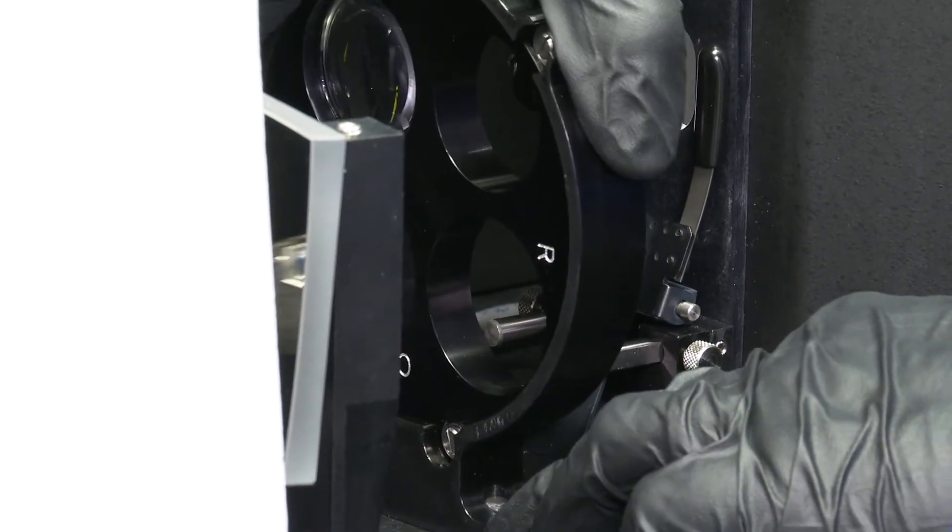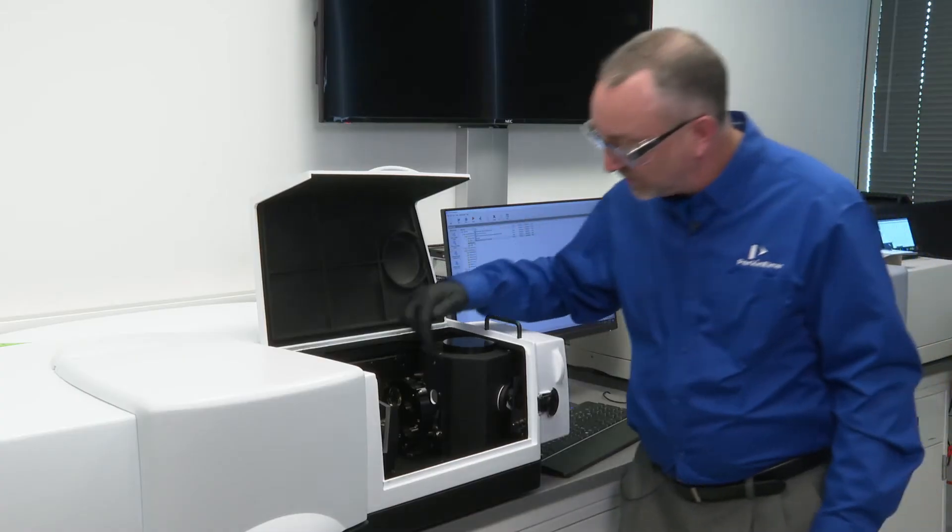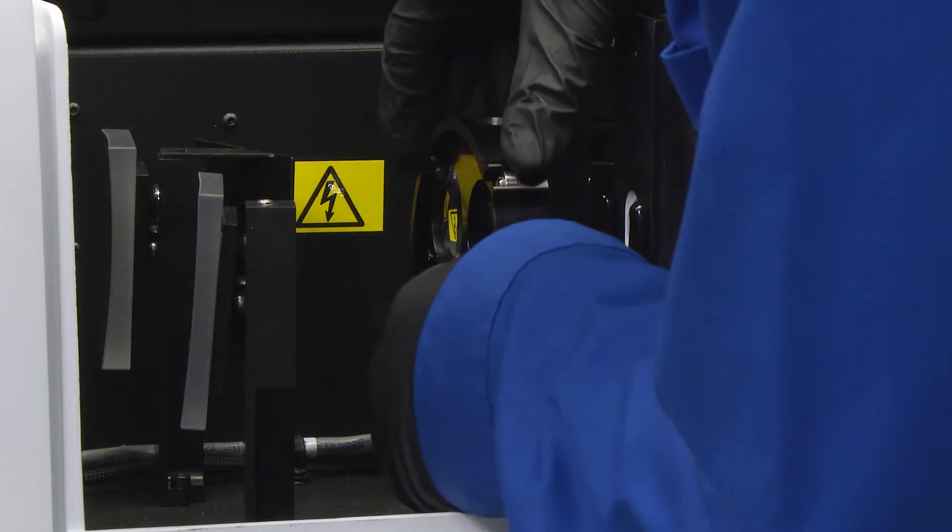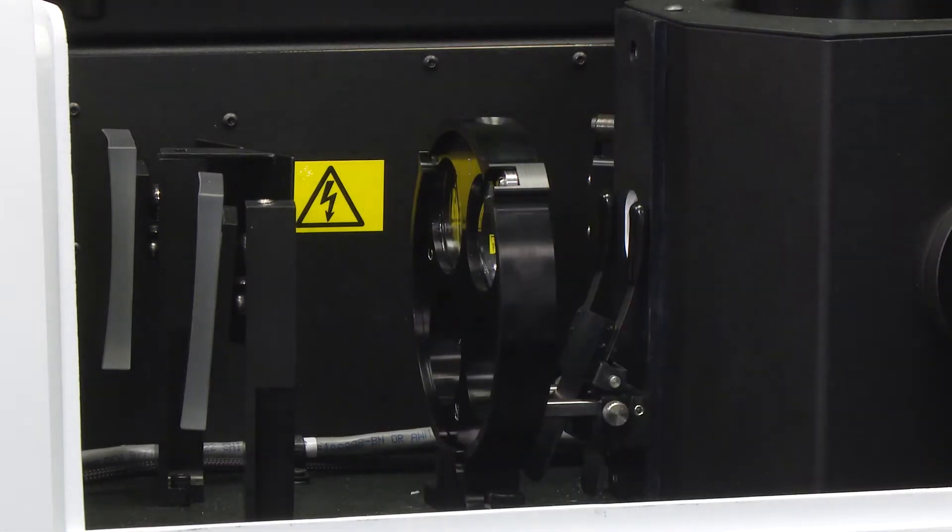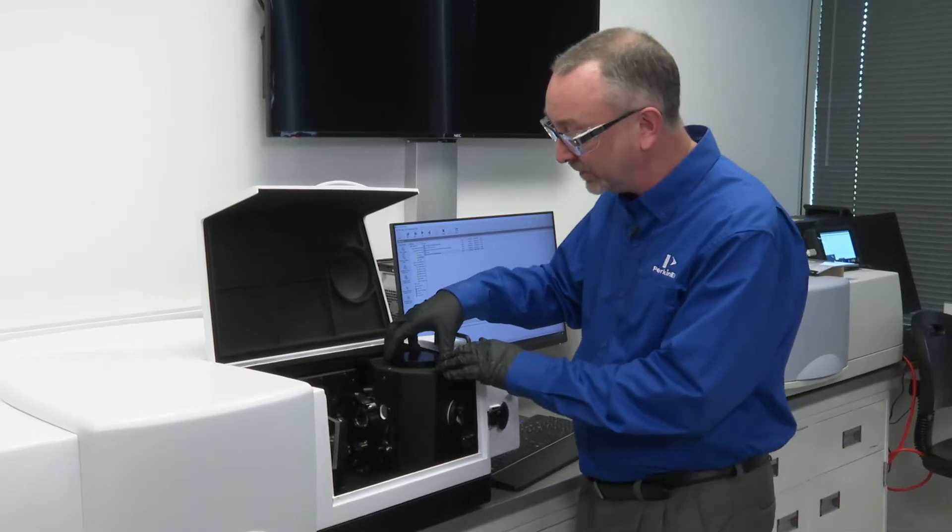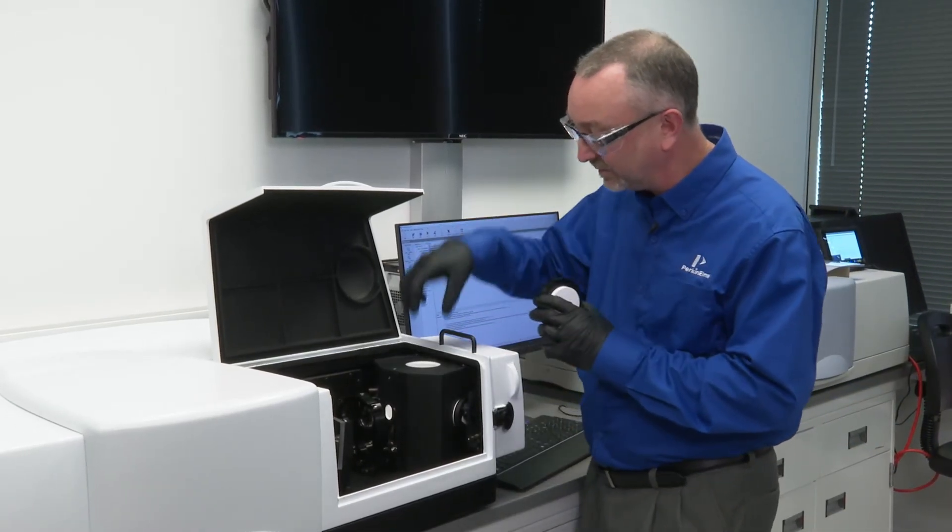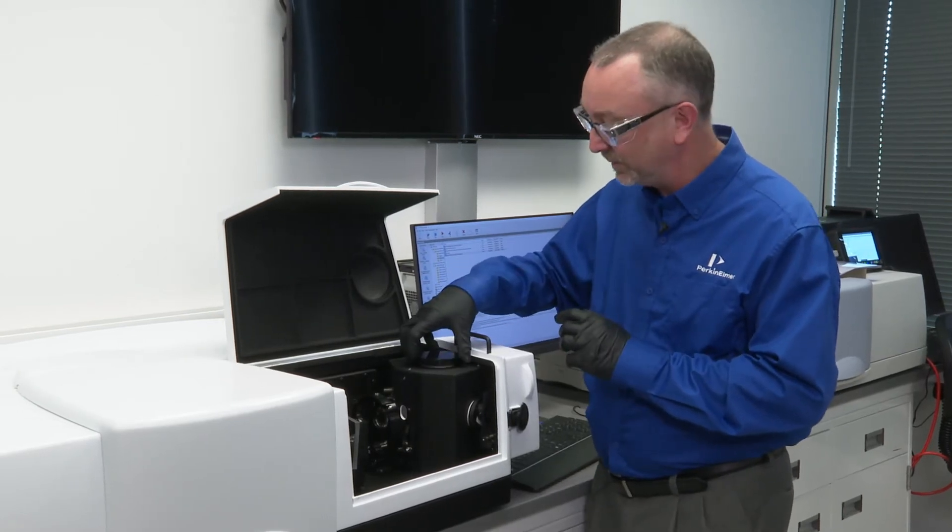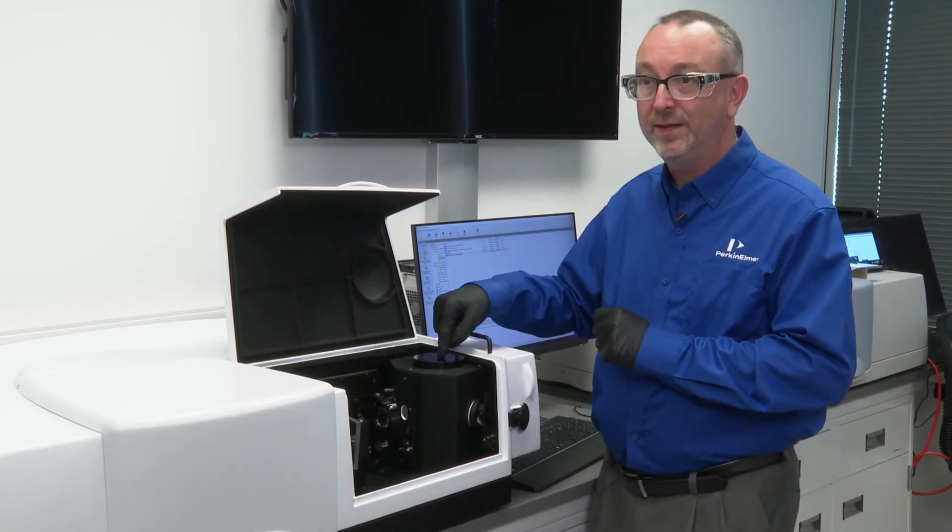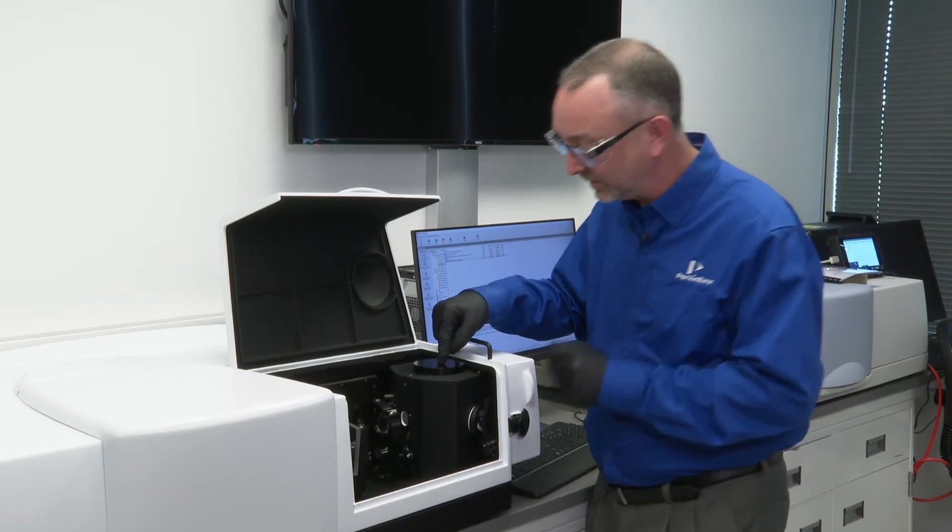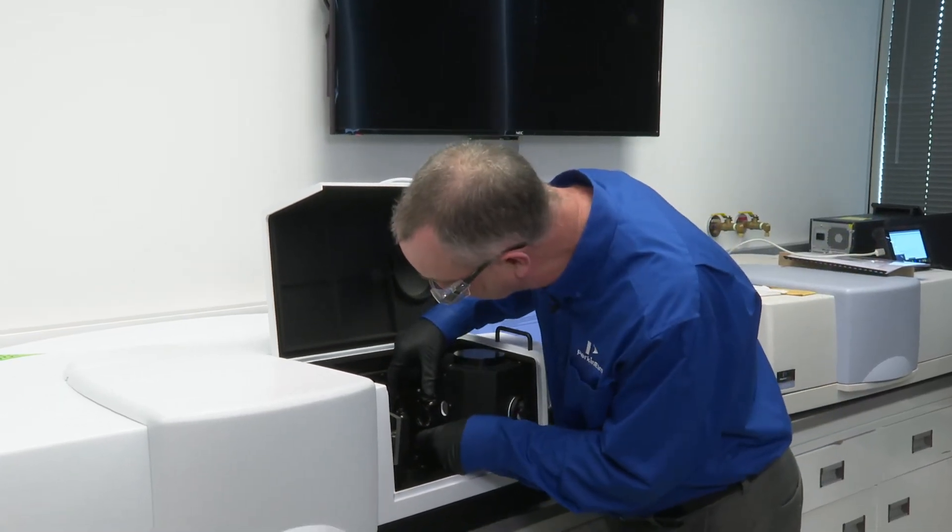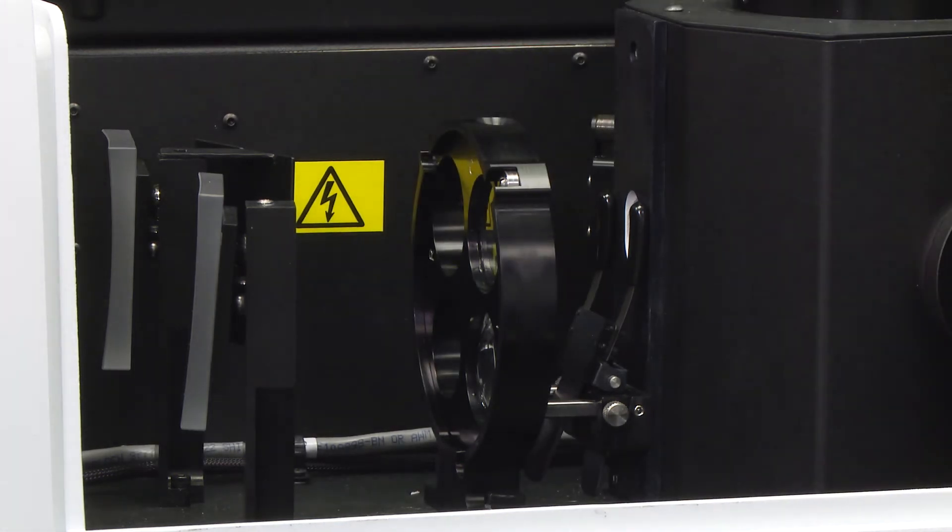So for example, if my sample was to be located here, I would simply move the lens to the T position. If my sample was actually inserted inside, we have a centre mount accessory such that the sample is located at the centre of the integrating sphere. Then we would use the C position.